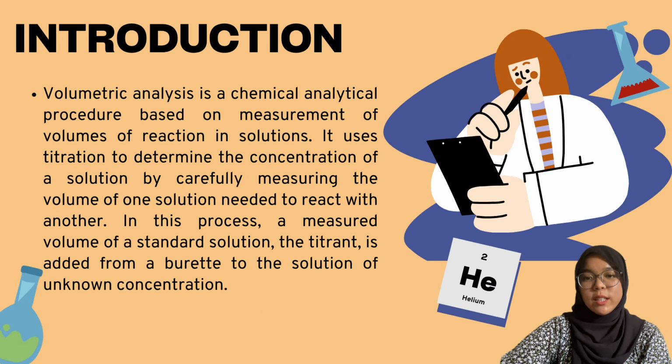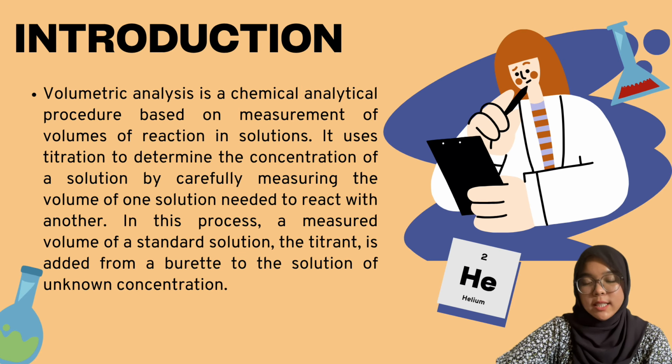Assalamualaikum. Today we are going to talk about volumetric analysis, which is a key technique in analytical chemistry. Volumetric analysis is a method that focuses on measuring the volume of a solution needed to react completely with another solution. This process helps chemists determine the exact concentration of an unknown solution. The method is commonly performed through titration.